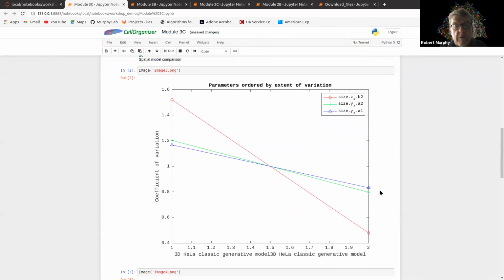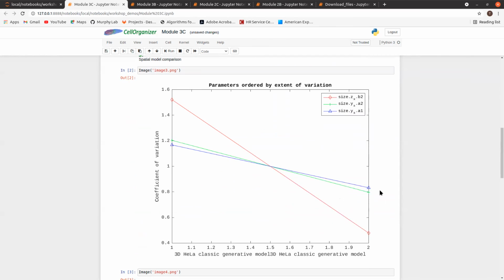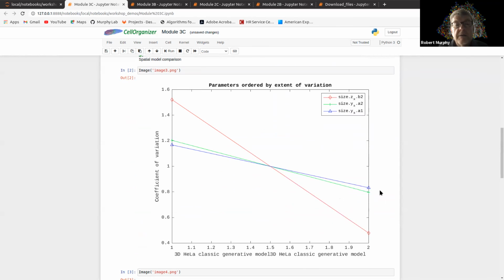so in this case, what we're having here, SLML report, if what you're comparing are two protein models, then what it does is it compares the values of the parameters of the model. Okay, so in this case, three of the parameters are the ellipsoid width, length, and height, X, Y, and Z coordinates.